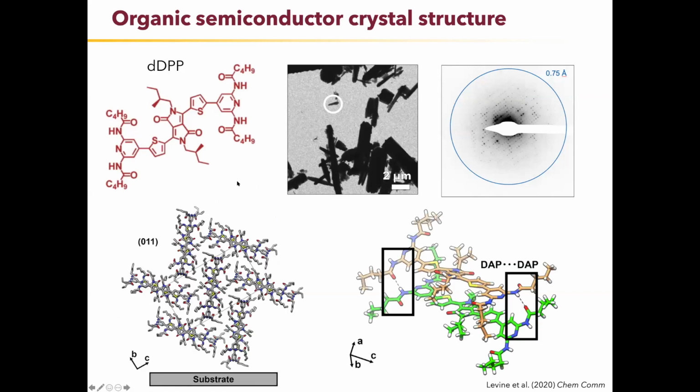A little bit of a larger organic complex here. You can see the unit cell is much bigger, big for a small molecule, I suppose. But again, we could orient the crystals to the substrate by combining the MicroED data with the wide-angle scattering data. So this is a really cool combination of techniques, giving thin film research a new tool for assessing crystal structure and orientation in thin films.